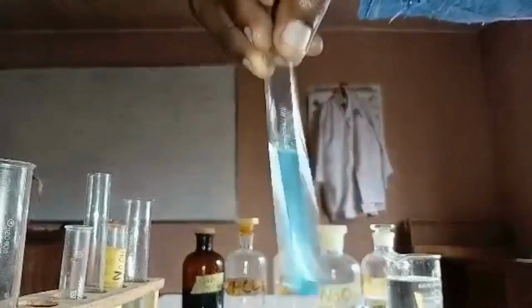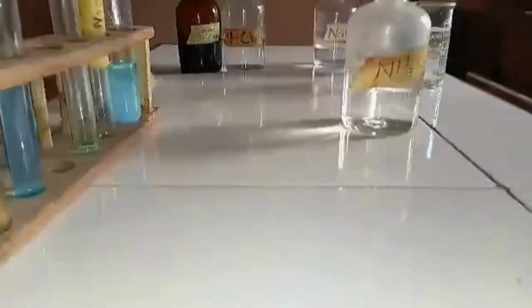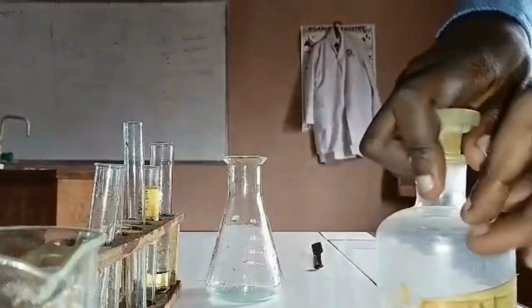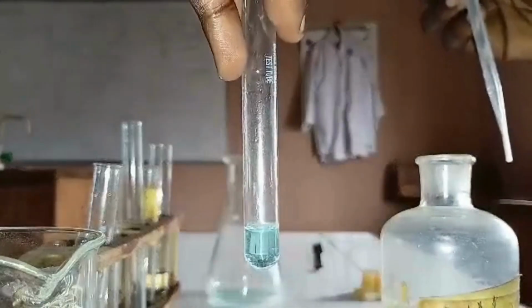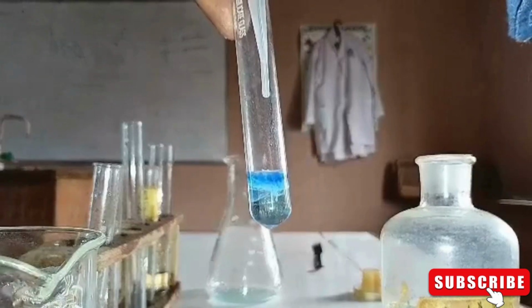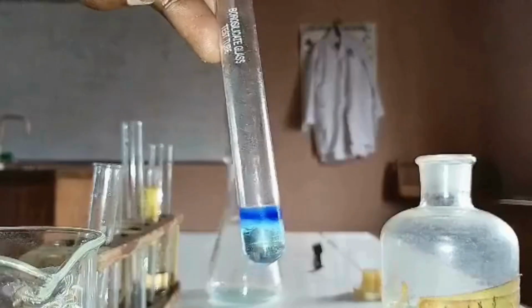Then we move to the next one, another precipitating agent, ammonia. And of course, we're going to add ammonia in drops. Now watch how the precipitate forms when we add ammonia in drops. Yeah, a blue gelatinous precipitate again, as you can see. On adding ammonia in drops, a very blue gelatinous precipitate. And then we're going to add in excess.